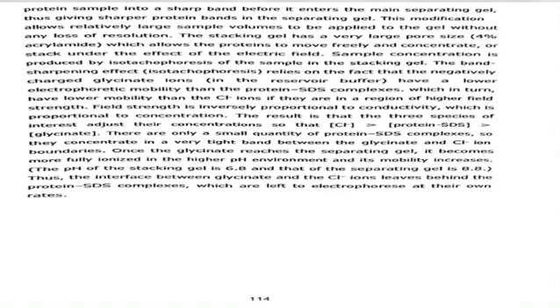The stacking gel has a very large pore size (4% acrylamide), which allows the protein to move freely and concentrate or stack under the effect of the electric field. Sample concentration is produced by isotachophoresis of the sample in the stacking gel.